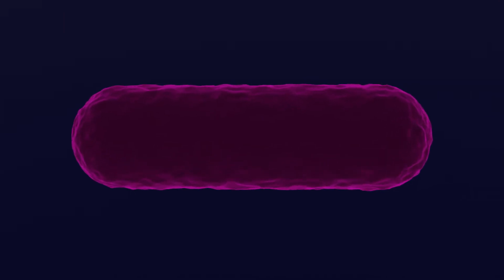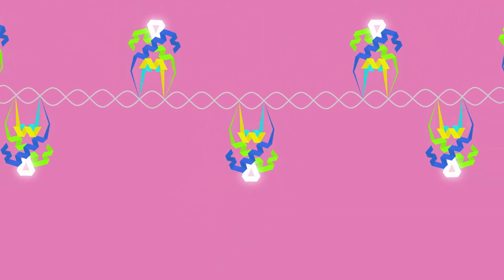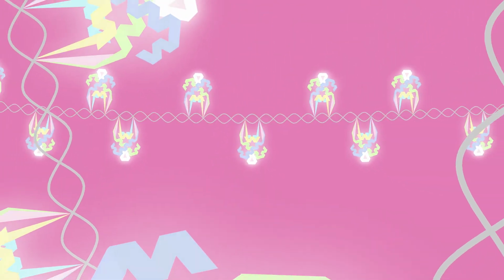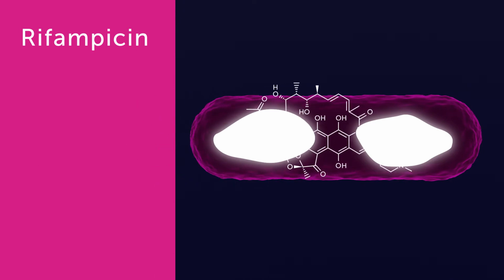For example, E. coli cells contain tens of thousands of copies of a protein known as HU, which binds to all parts of the nucleoid. By imaging this protein, we indirectly observe the nucleoid shape and can visualize how antibiotics, like rifampicin, a major drug used in the treatment of tuberculosis, decompact the bacterial nucleoid.